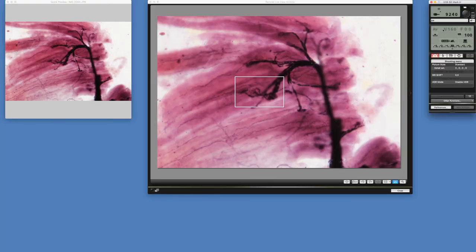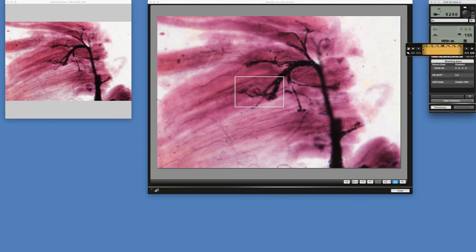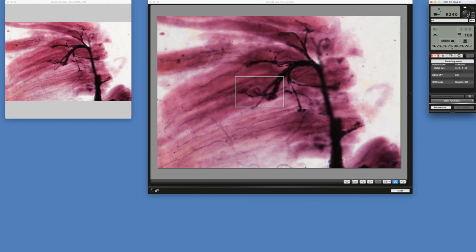That took the shot at 1/160th of a second — much faster — and we get this nice image. If we want the exposure to be a little less bright, we can play with exposure compensation. That's 1/3 of a stop, that's 2/3 of a stop, and one full stop less would be half as much light. I'm going to stop at 2/3 of a stop and take the photograph. Now we have a slightly darker image.